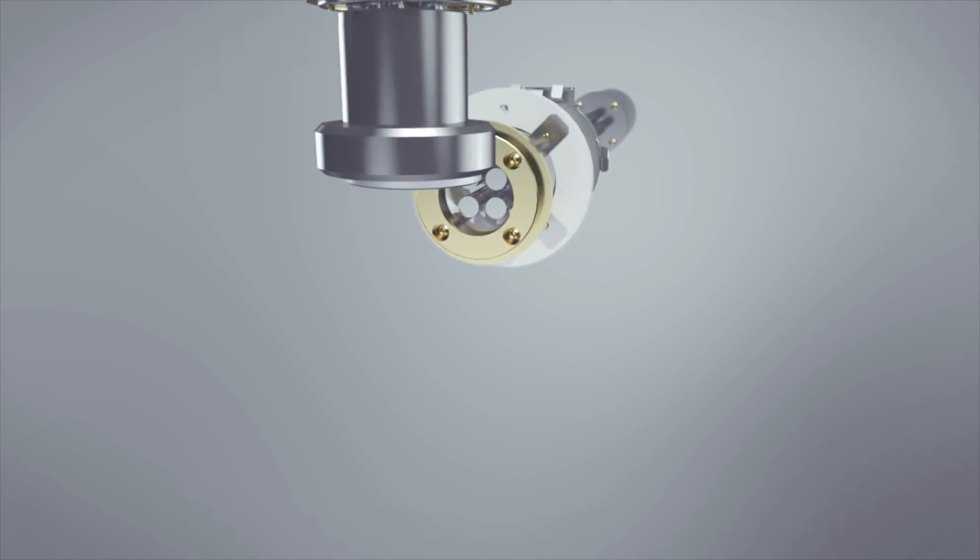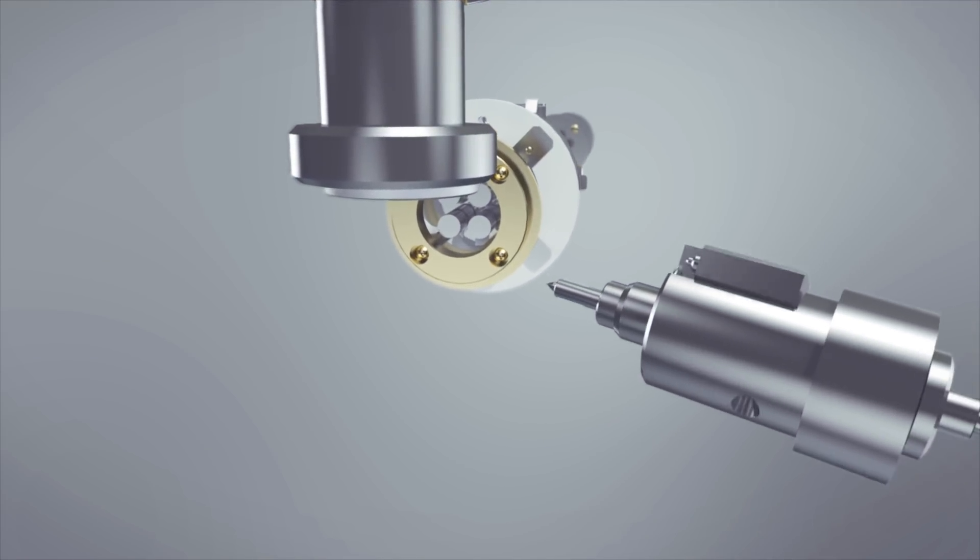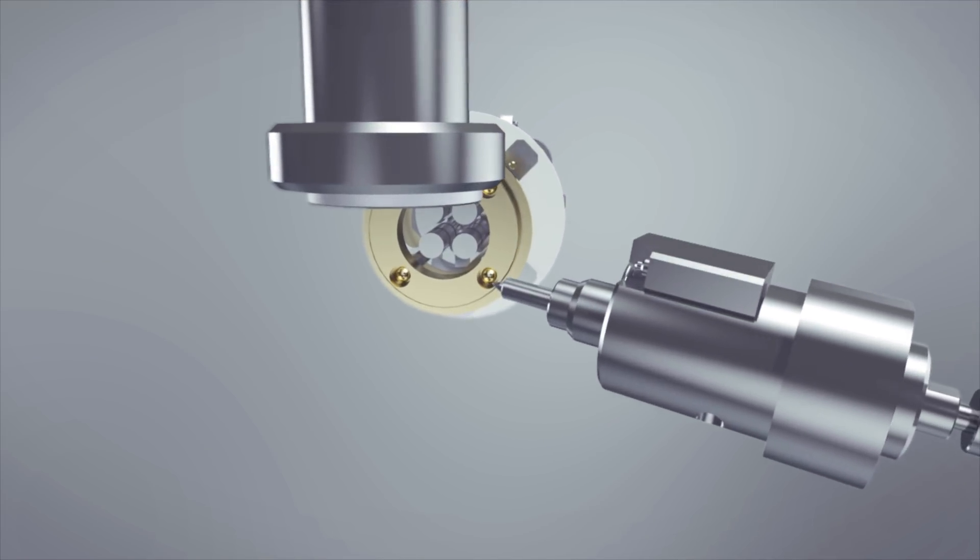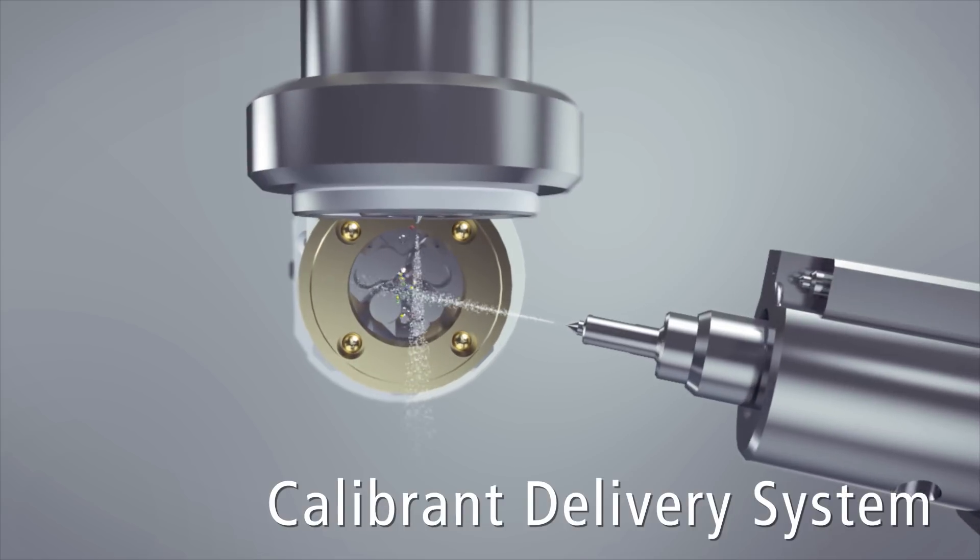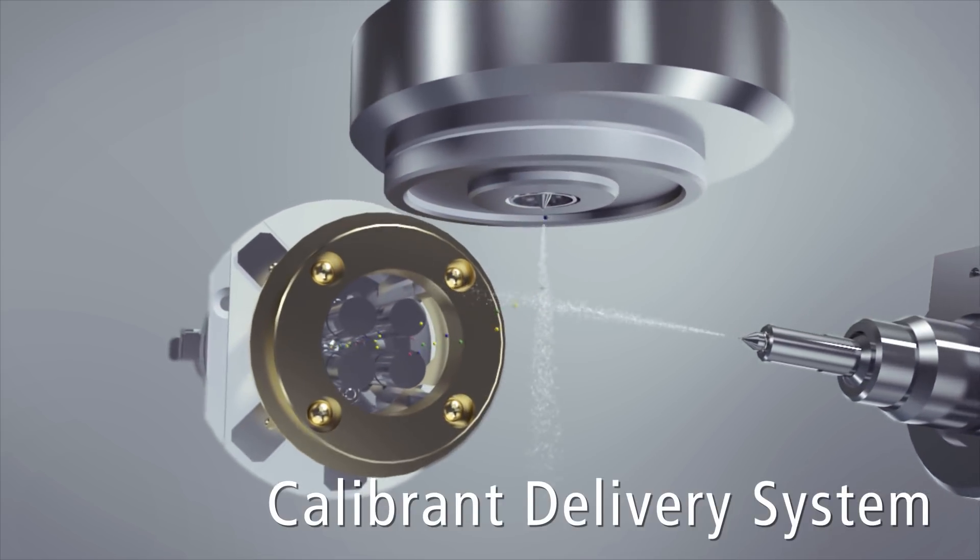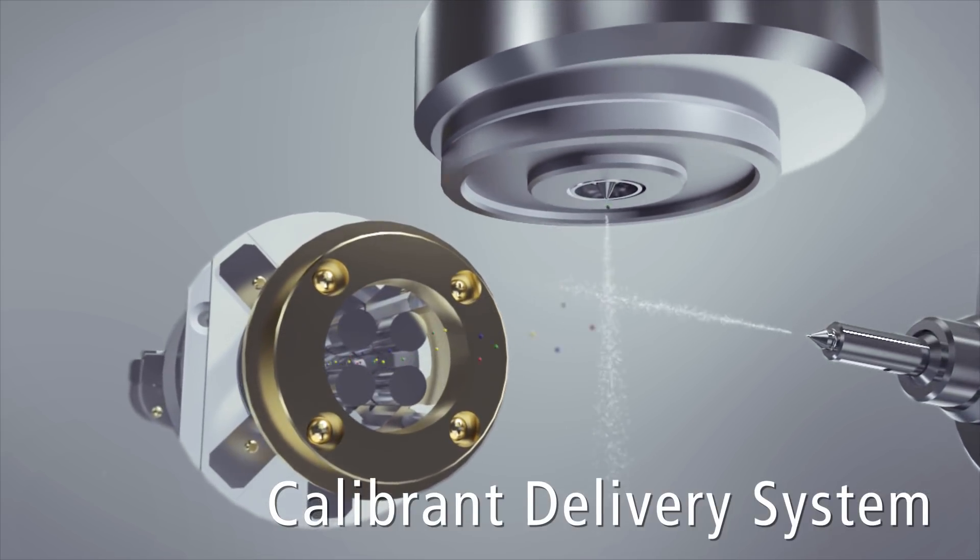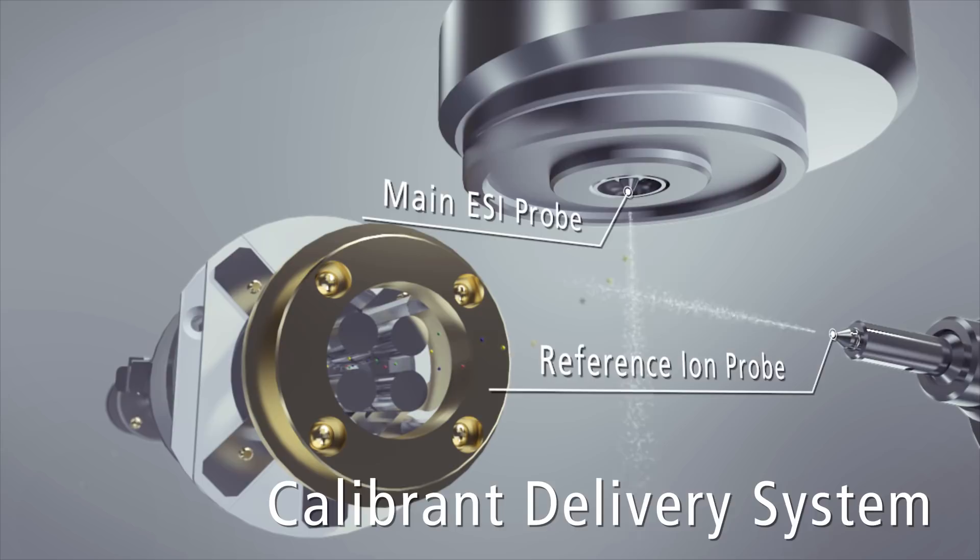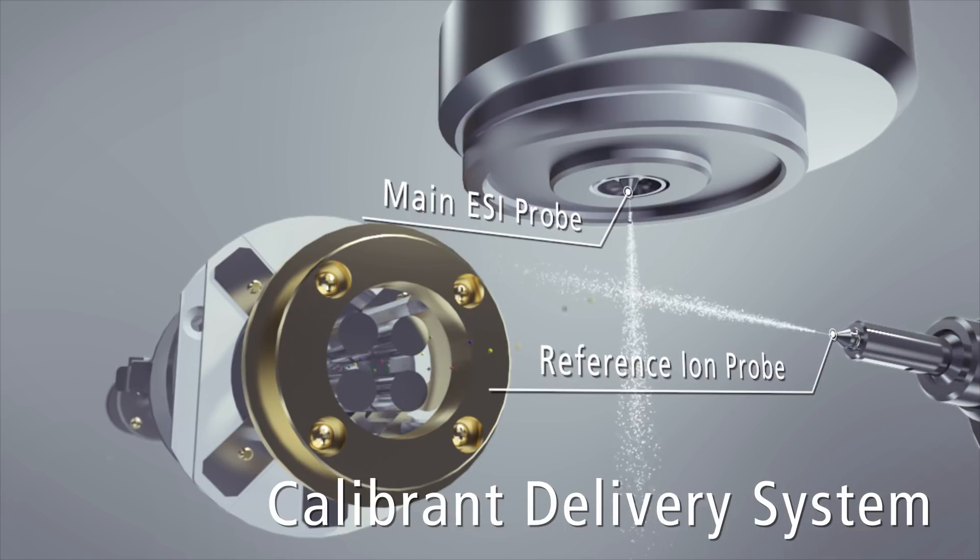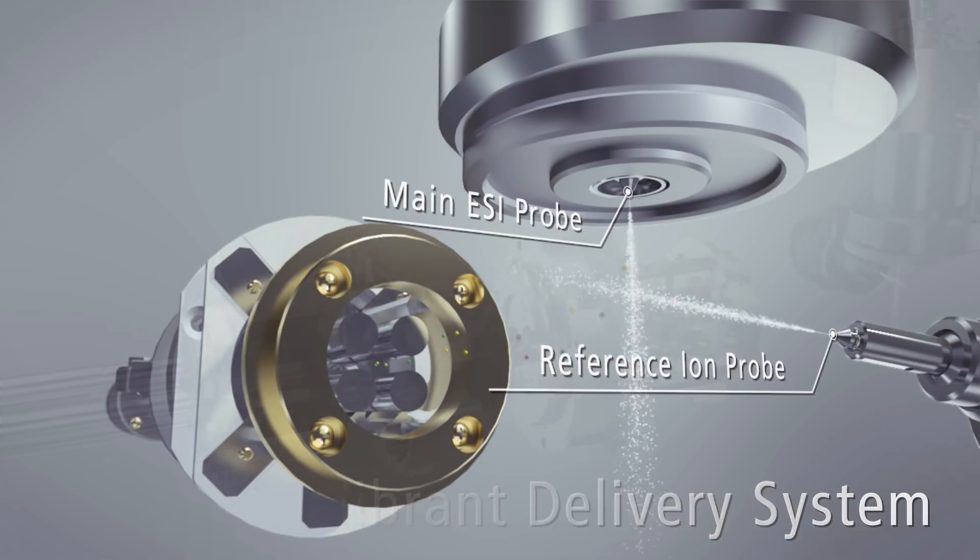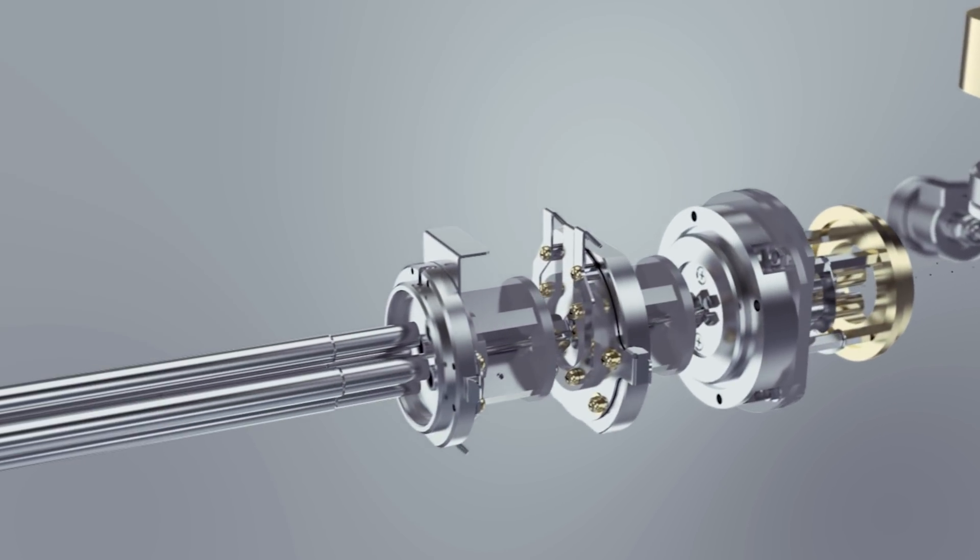For sample introduction, the LC-MS 9030 uses a calibrant delivery system. An independent ESI probe is dedicated for calibrant ionization to ensure successful mass calibration whatever the experimental conditions.